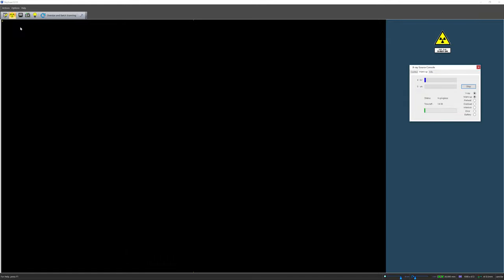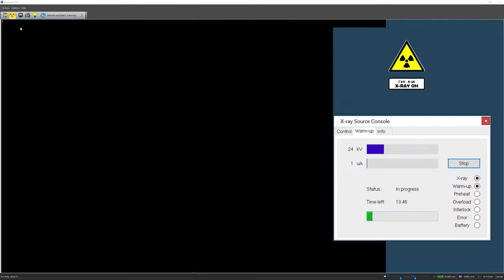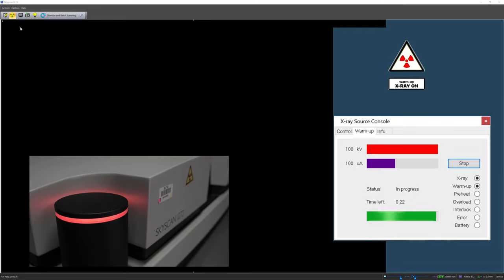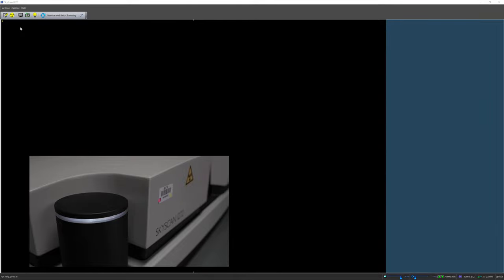Once the x-ray is switched on, if the x-ray source needs to go through an aging procedure, an x-ray source console dialog will also appear with the x-ray sign flashing. Aging means warming up the x-ray source by gradually increasing the voltage and current to protect the lifetime of the x-ray source. After 8 hours of inactivity, the aging procedure will be activated and it will take 15 minutes to gradually warm up the x-ray source. Once warmed up, the x-ray source will be switched off automatically and the console dialog will close. The LED x-ray indicators will stop flashing and return to solid white.